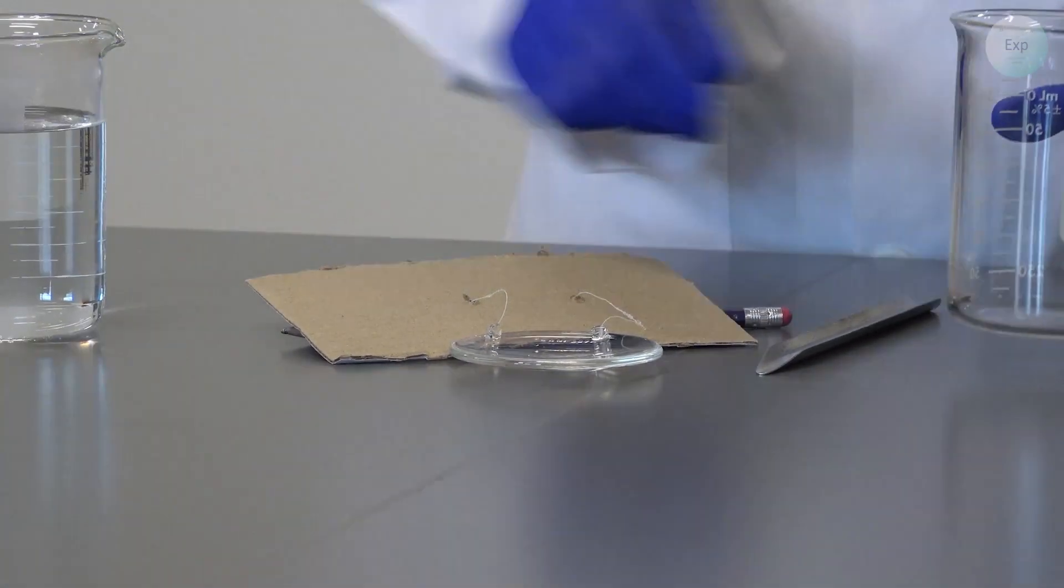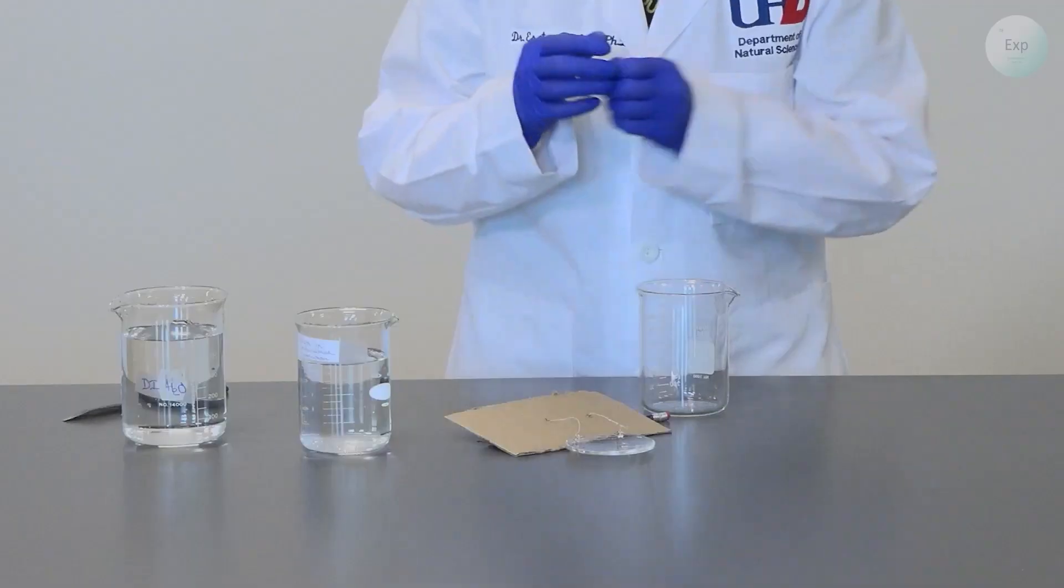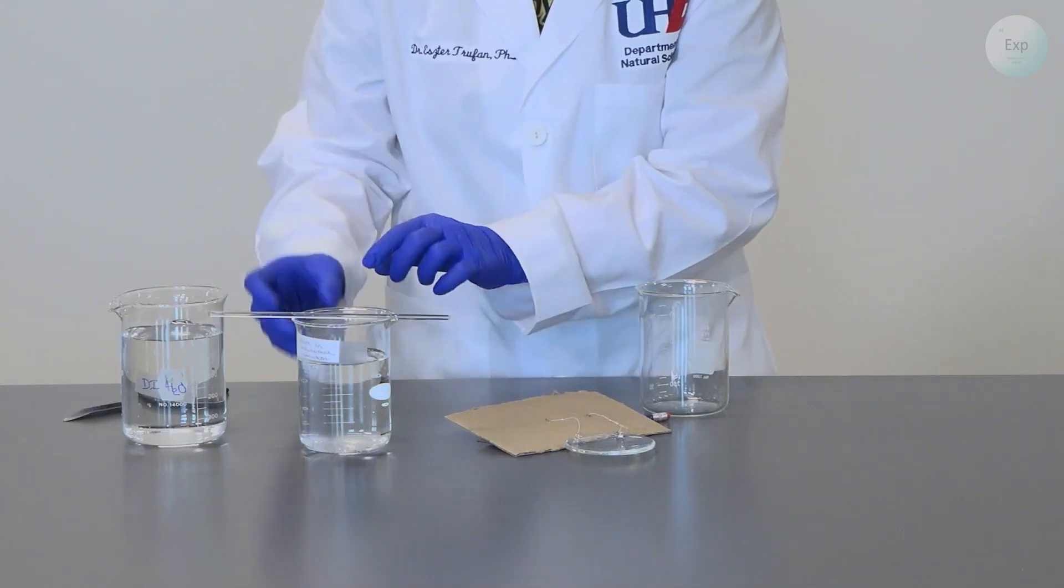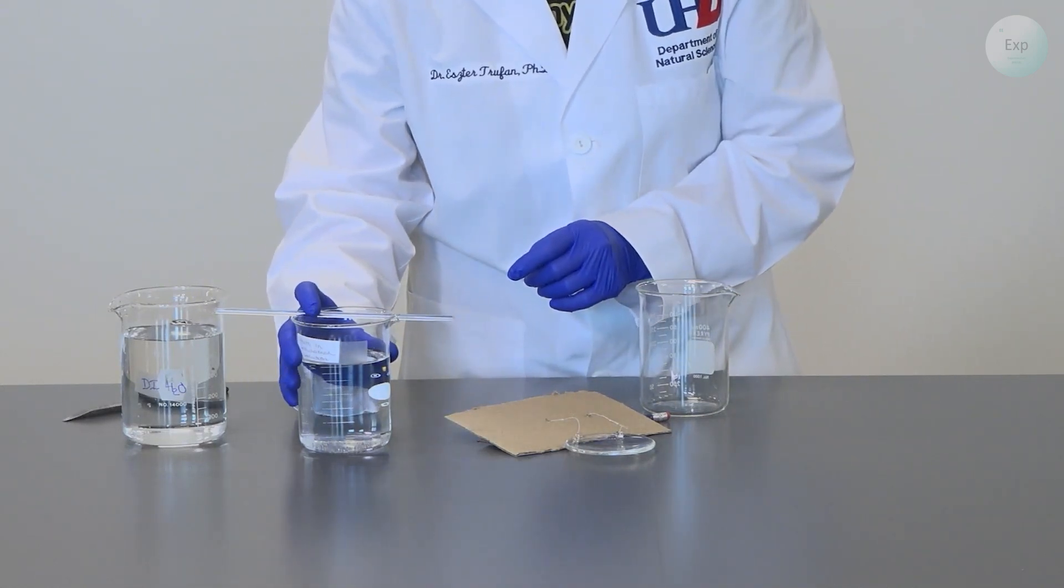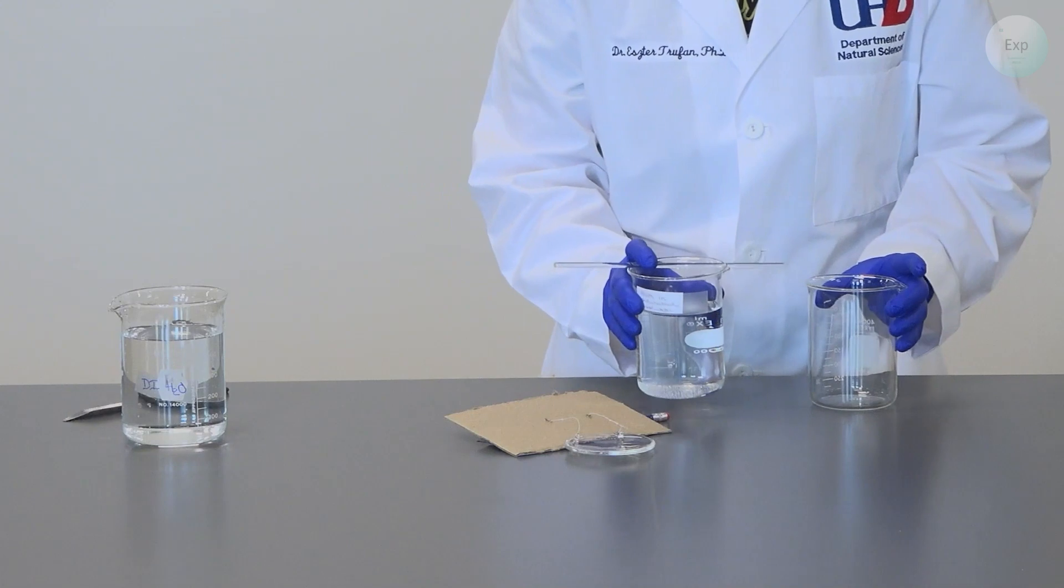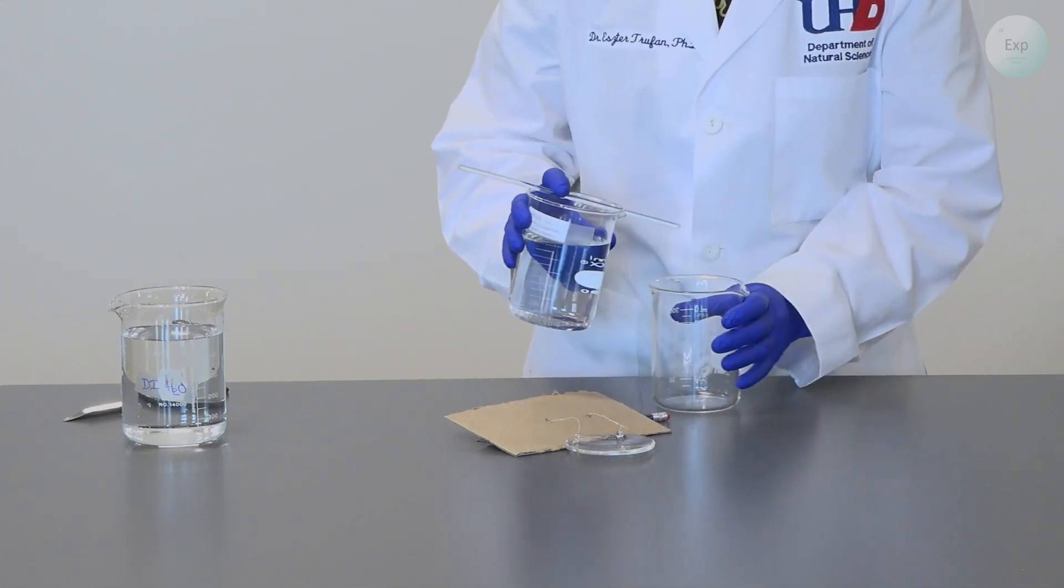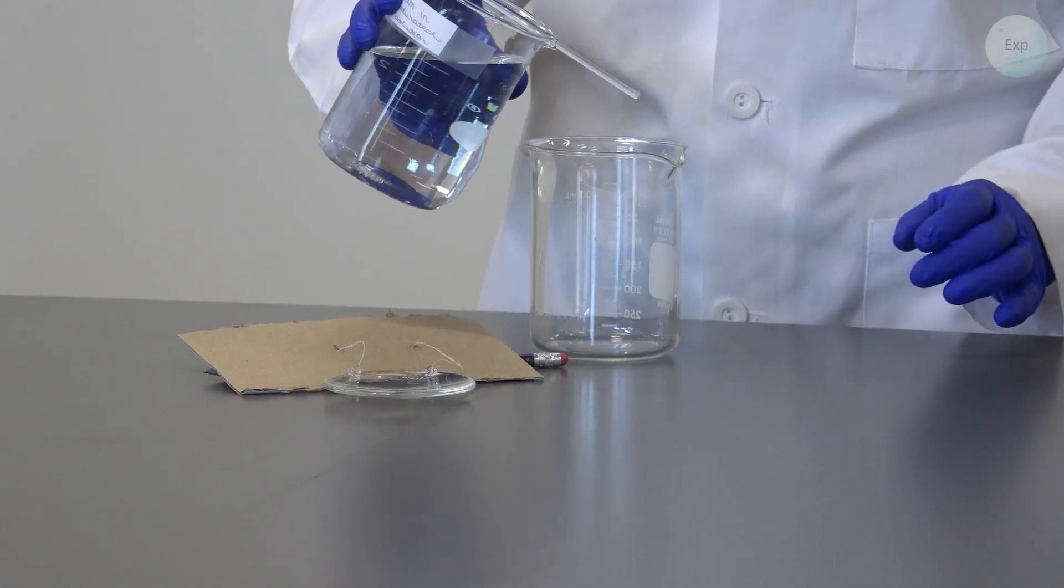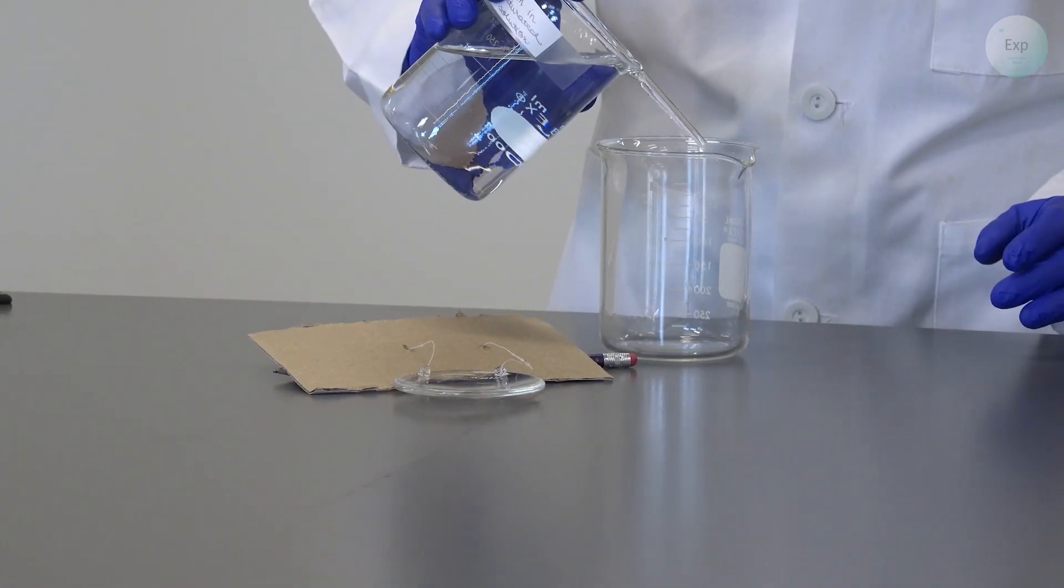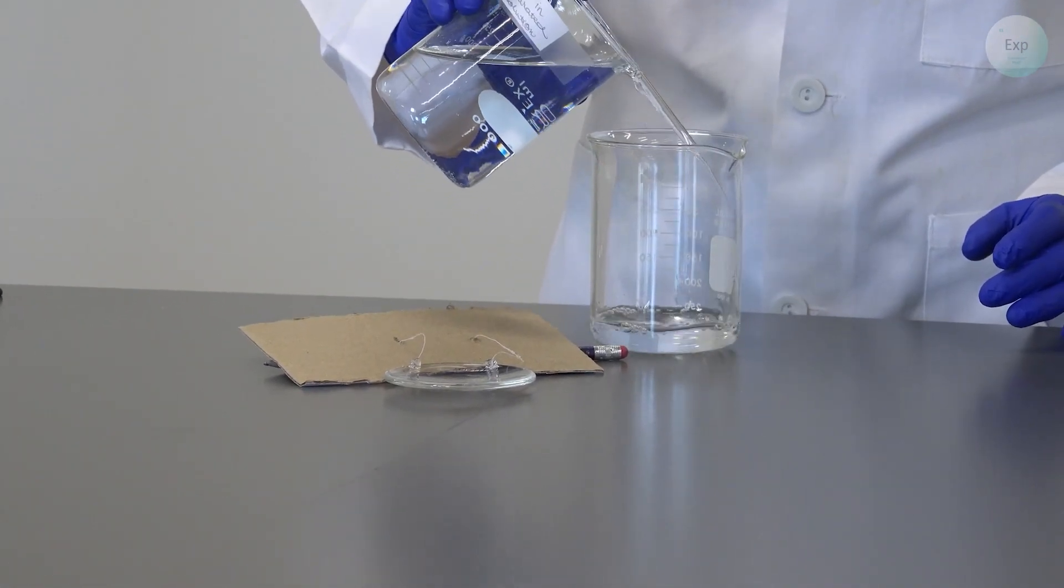Then I will decant my solution. For decanting, you want to place a stirring rod across the top of your beaker, just like this, and then as you lift it up and hold it in place, your solution will follow the path of your stirring rod and transfer to where you want to send it.